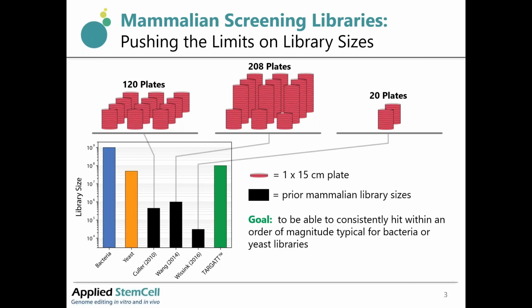By using our TARGATT technology, our goal is to be able to hit within an order of magnitude typical for bacteria or yeast libraries. So finally, the library size we expect will be around 10 to the 8th to 10 to the 9th.